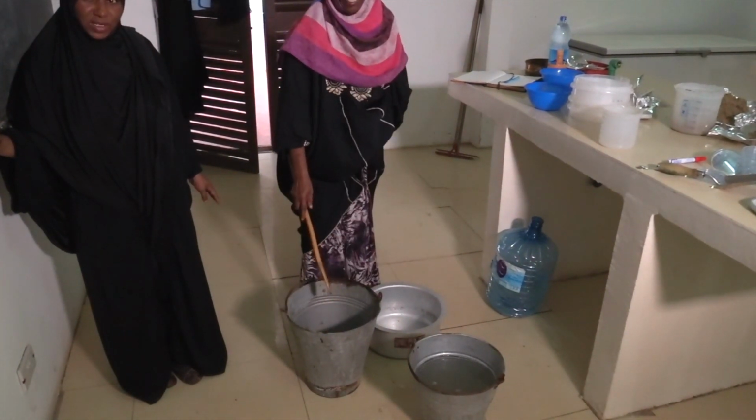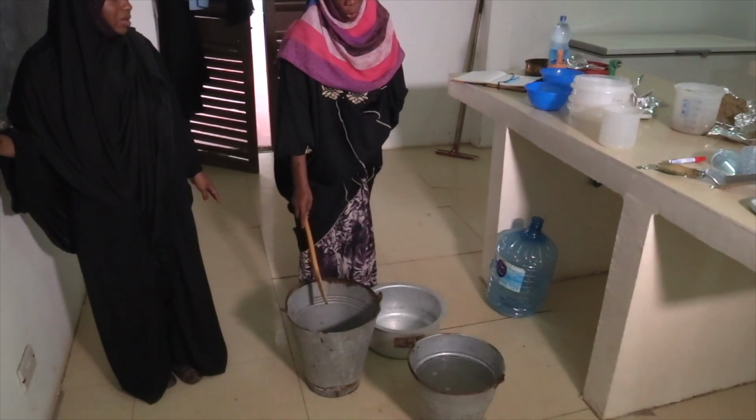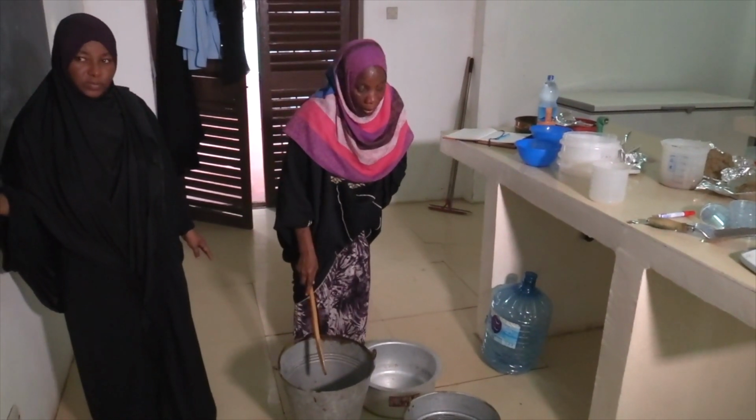As we know, plastic particles are lighter than water, so they must move up and be suspended in our solution.